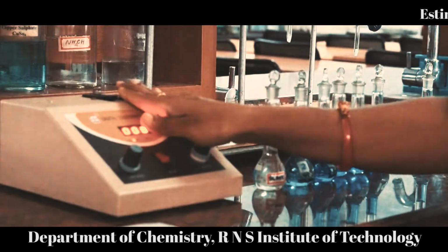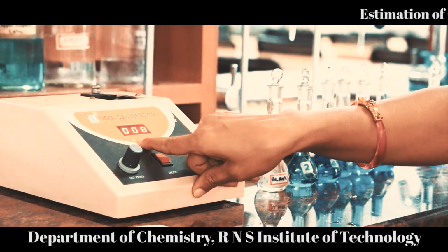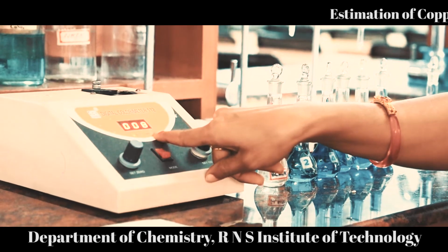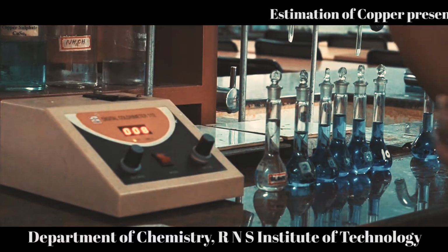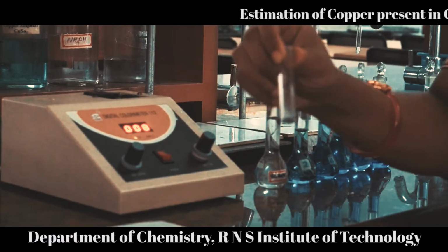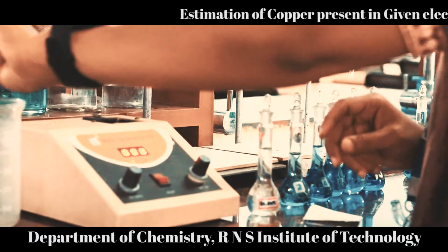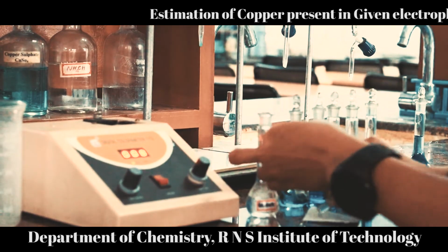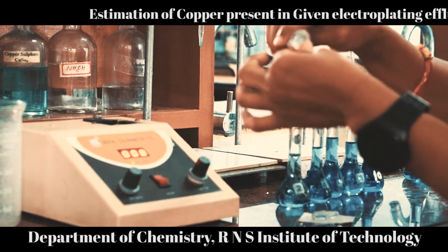We have a digital colorimeter to take our readings. We have a percentage transmission and absorbance. The wavelength is set to 620 nanometer, and the cuvette in which we are taking the readings, rinse the cuvette with blank solution. Fill the cuvette with the blank solution.